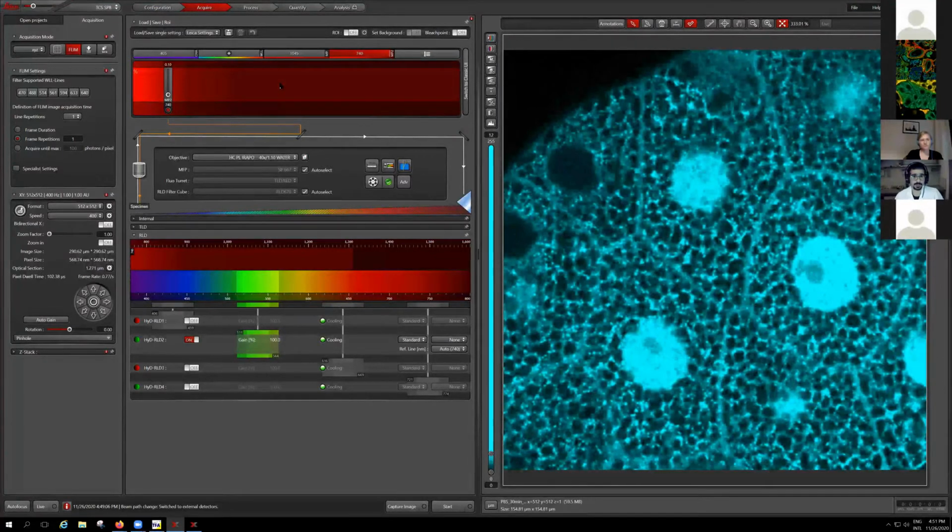And that's one way. And the other way is that there is a suggestion and also a publication from the Mamaghani lab saying that you can excite both of them with one laser line, and they take in different ranges, and then you have really negligible contribution or bleed-through of NADH to FAD.